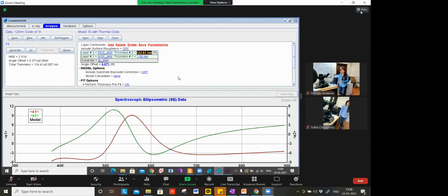Since I'm not working in this field, I have a cross question. Maybe you will say, why should you answer, and whatever. I will discuss this with sir also. If I should use Cauchy instead of tungsten, then why has anybody given any model for tungsten and for any metal?